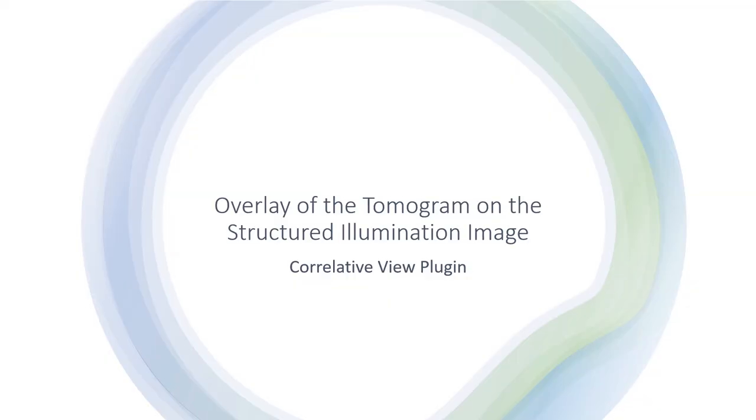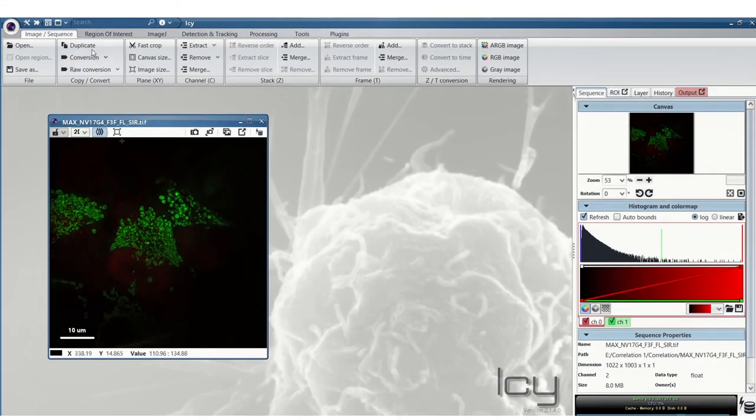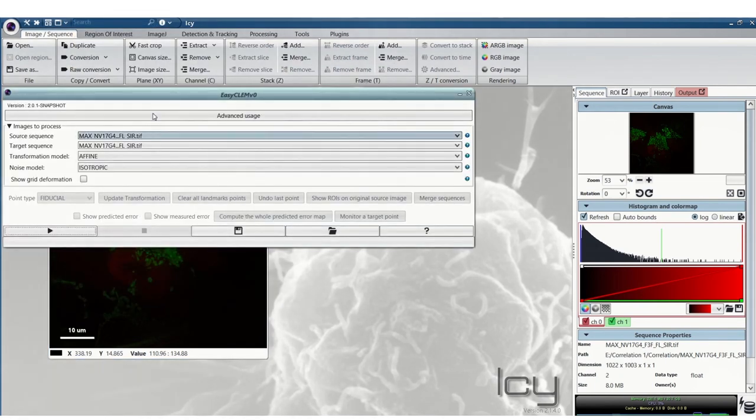Finally, this is how to use the new correlative view plugin. This is so we can get an overlay of the tomogram on the sim image. Currently at the time of this video it works in 2D so we can use the maximum intensity sim image here.